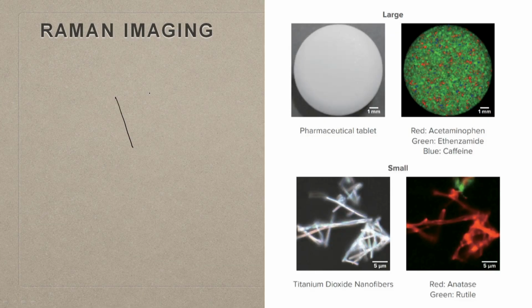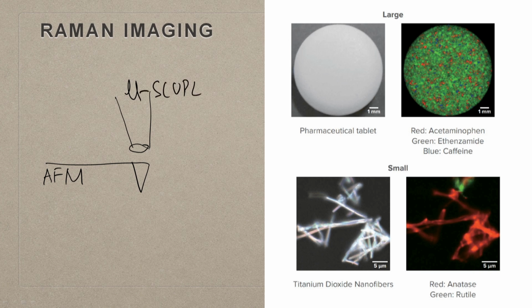One of the ways is that you have a microscopy, you have an AFM, and you have a spectroscopy.